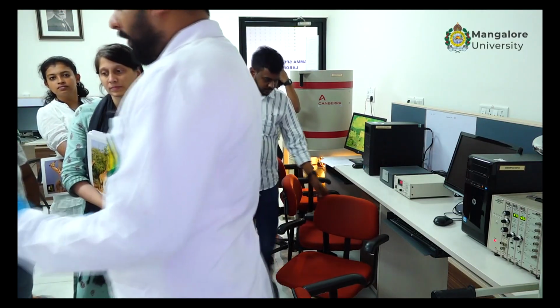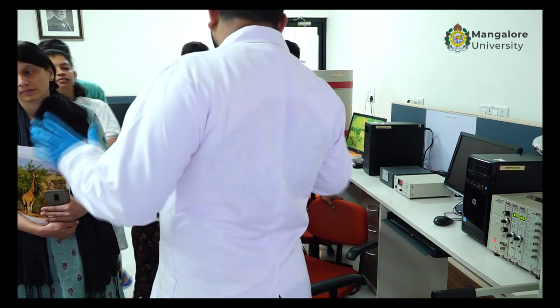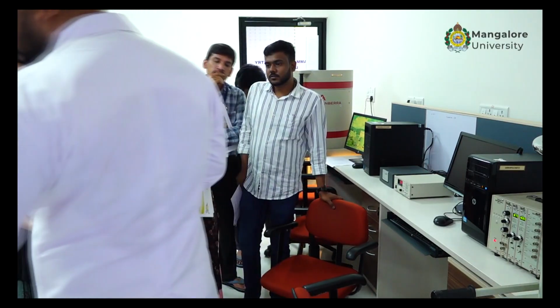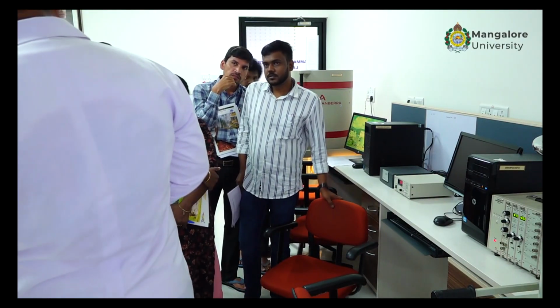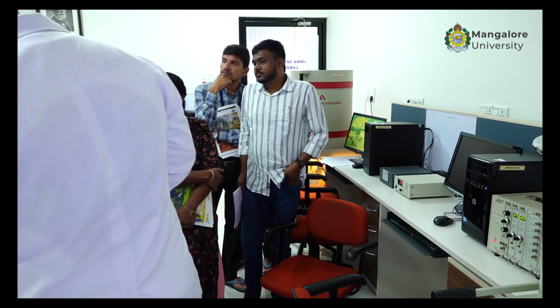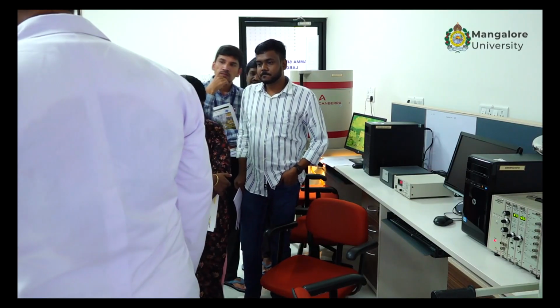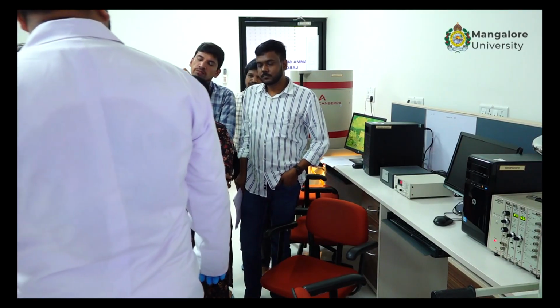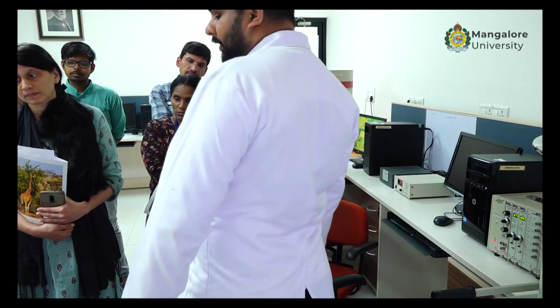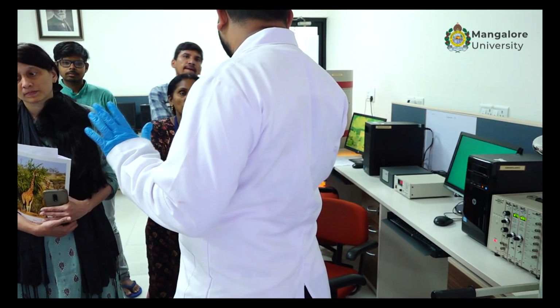This is basically the sample that the IAEA gives us. They don't tell us anything. They just give the values of the standards. They will give the value of one swipe sample which has activity, and then they say you have to analyze and give us the results.